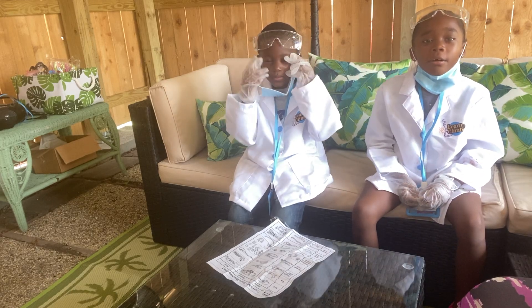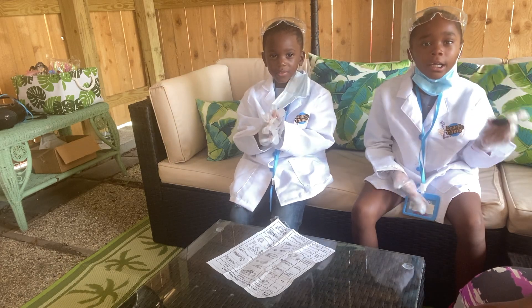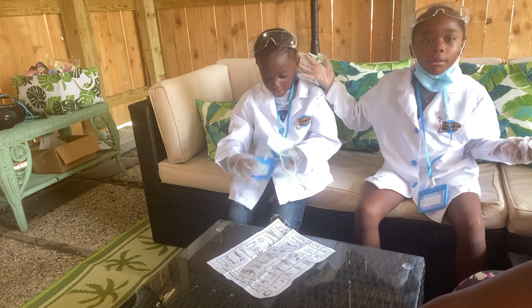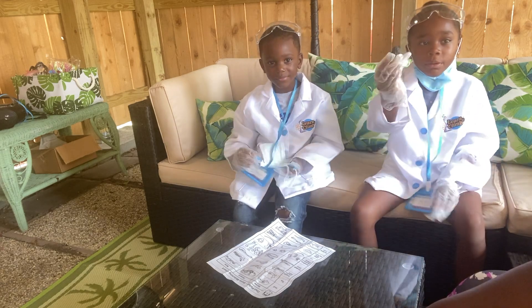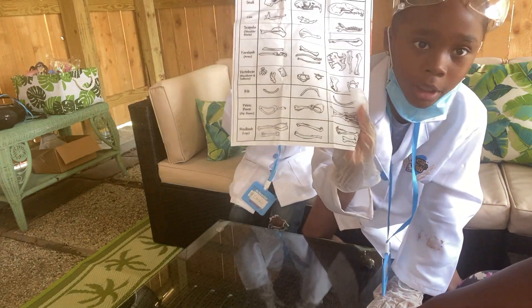Hi guys, today we're going to be doing a pellet and we're going to see what's in it. I'm Scientist Jayla and this is Scientist Carmel and we're going to see what's in the pellet. We have this chart to see what we're going to get.